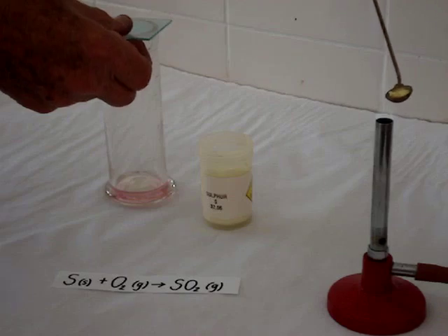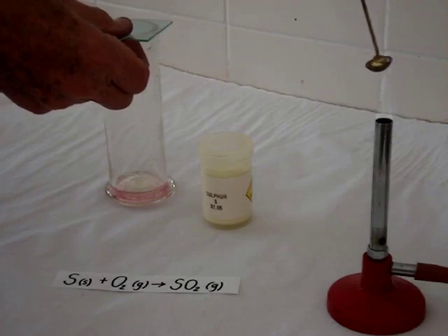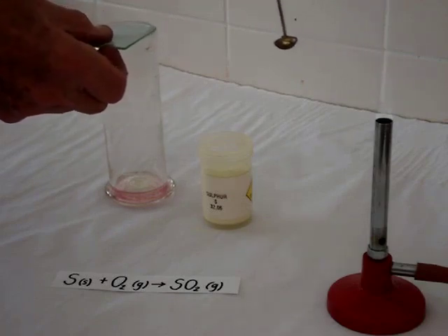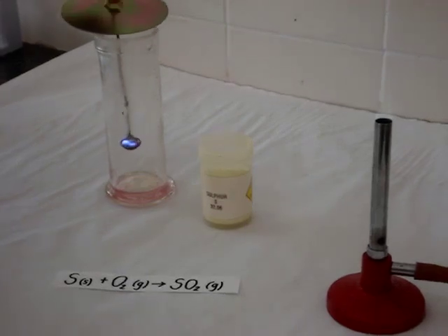We have some oxygen. Once the sulfur has ignited, we'll plunge the burning sulfur into the oxygen, and it will burn brighter in the oxygen than just in air.